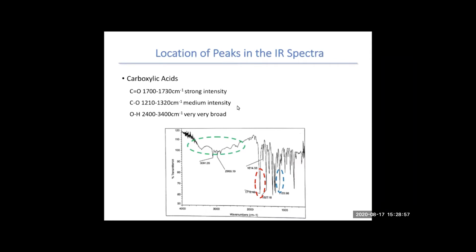The OH peak is a very broad peak. The last one we saw in our previous lecture showed the peak coming down and taking up a good part of the spectra. The carbonyl OH can also look like this, where it's just a small dip down in our spectra. And I've highlighted it in the green dash for you to see.